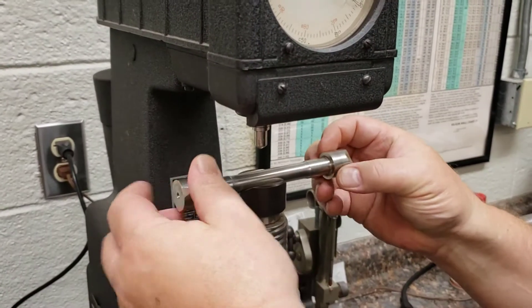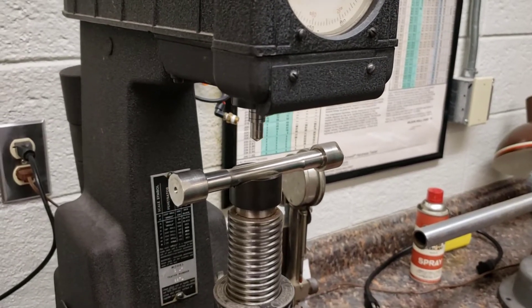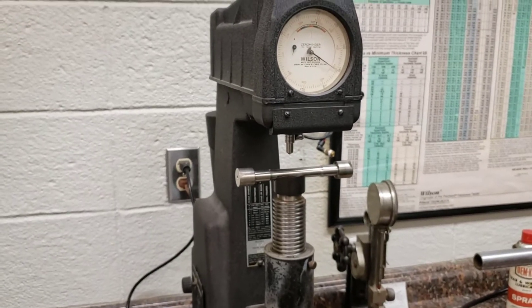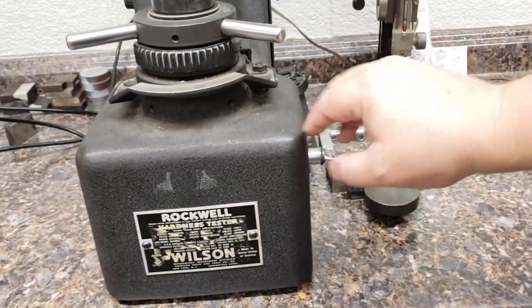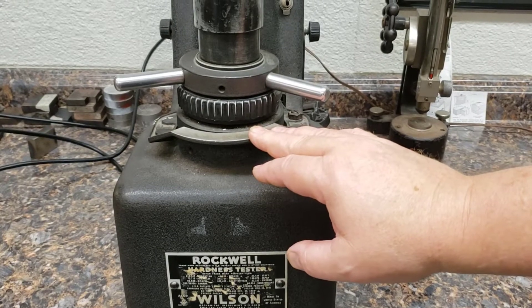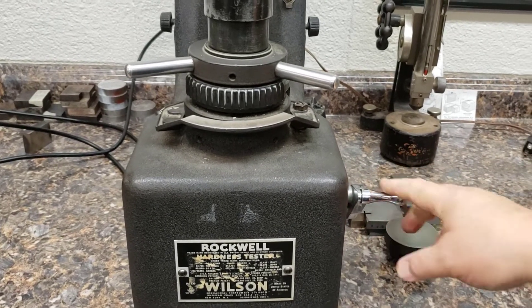Carefully put in the specimen. Notice you're not trying to bang the Brale — that doesn't do anybody any good. The manual tester is a little harder to use because you still have to set the preload and the load, but it's done using this dial here. Then there's the trigger switch, which you may not realize is a switch. We start by setting for the preload.